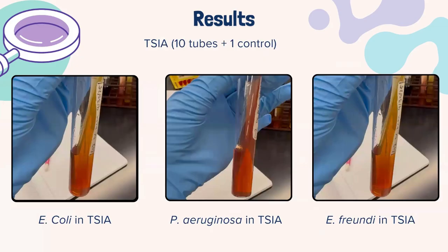These are our TSIA results, or our triple sugar iron agar. There are 3 sugars present in these, including glucose in low concentration and lactose and sucrose in high concentration. These are to differentiate fermentation patterns. We stab the anaerobic butt for glucose and hydrogen sulfide, and the streaking will inoculate the aerobic slant for lactose and sucrose. Our E. coli appears to be a red yellow, but it should have appeared yellow and yellow.